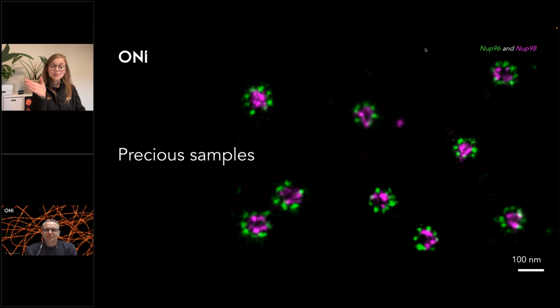And are there also any specific human cell types that we need to watch out for that have extremely high autofluorescence? Yeah, in terms of human cells, I have a good example. When I was working in immunology, we had some biopsies from COPD smoker patients, and they were isolating macrophages. What we realized is that those macrophages are pretty black. When you shine a high laser, we used a different technology than STORM.